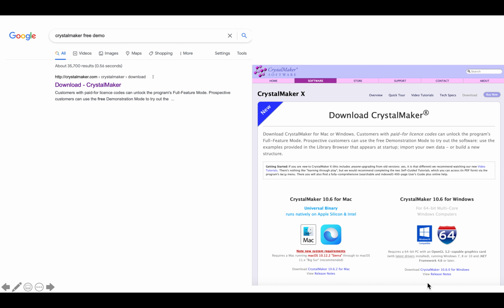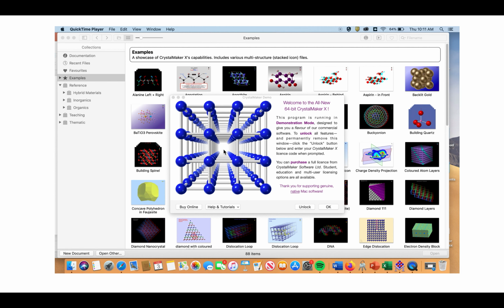It continues to have a free demonstration version. How long that'll last, I'm not sure. After this video goes viral and 10,000 people grab the free version, maybe they'll change their policy. But for now, you can just Google CrystalMaker free demo, take the link. I'm a Mac person, so then I just grab the one that's available for the Mac. No cost. They're trying to show you some of the features of the program.